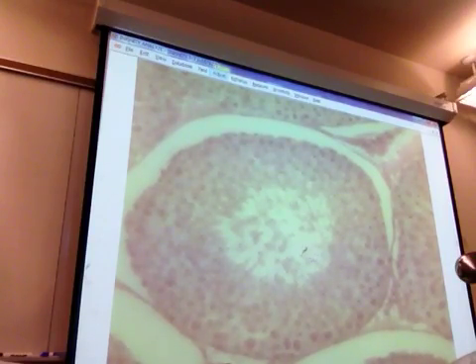So again, the spermatogonium, the nurse cell. Remember, this is nurse cell cytoplasm without a nucleus here. You can look to see if there's a break up here and then follow the cytoplasm back down. That's a nurse cell, because you can follow the darker cytoplasm going in between these cells. The other key is looking for stacks. If you've got a definite stack, what's this thing? Spermatogonium, good. What's this? That's a nurse cell.